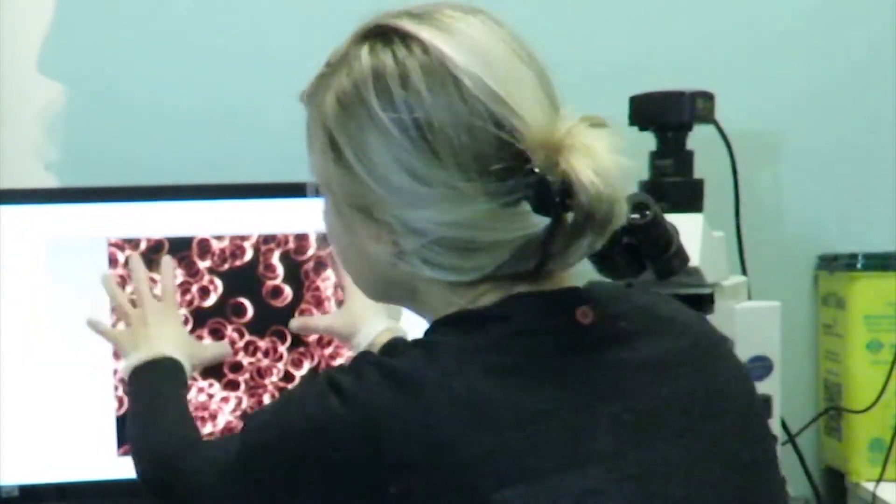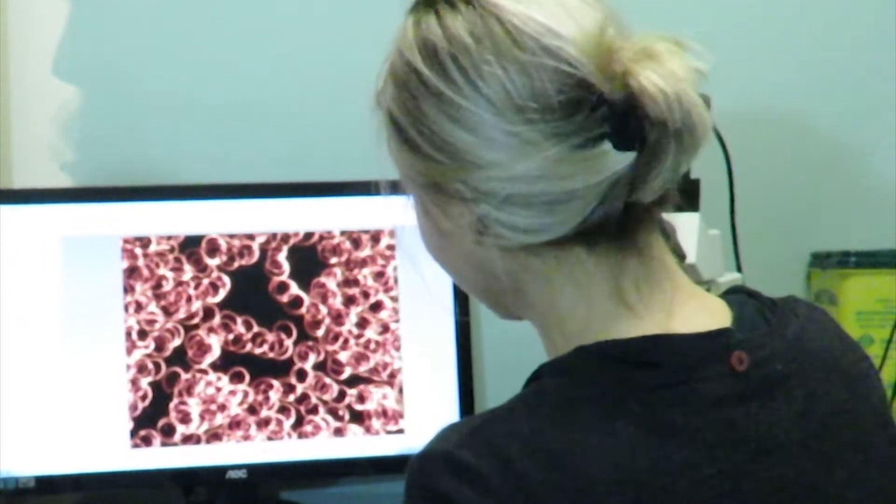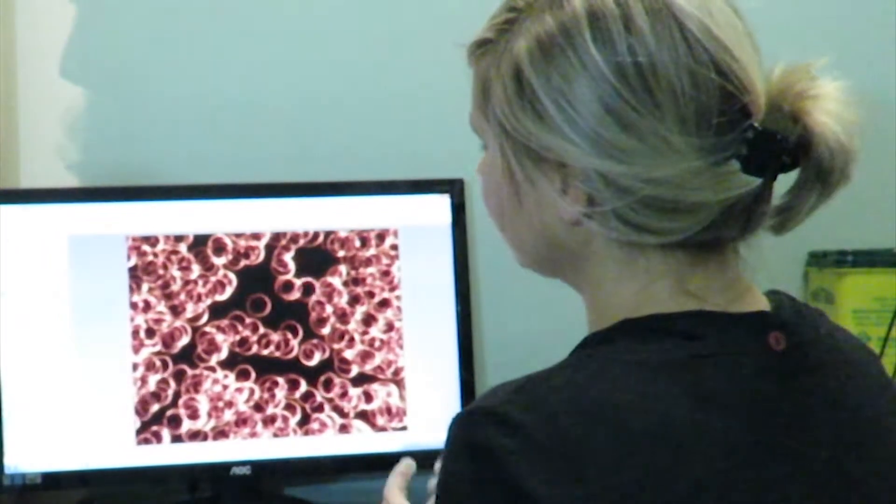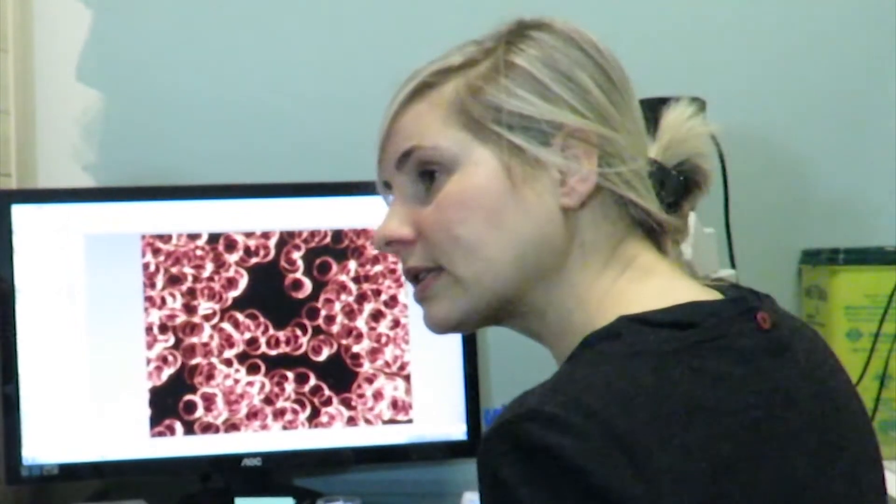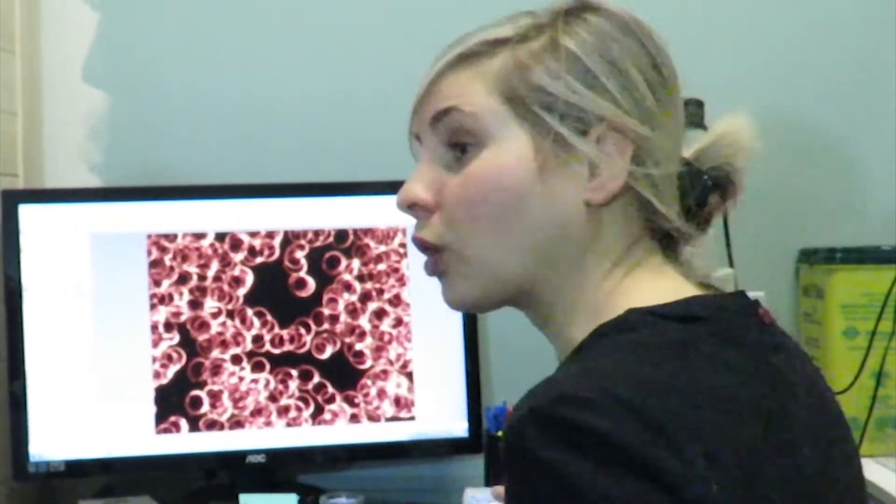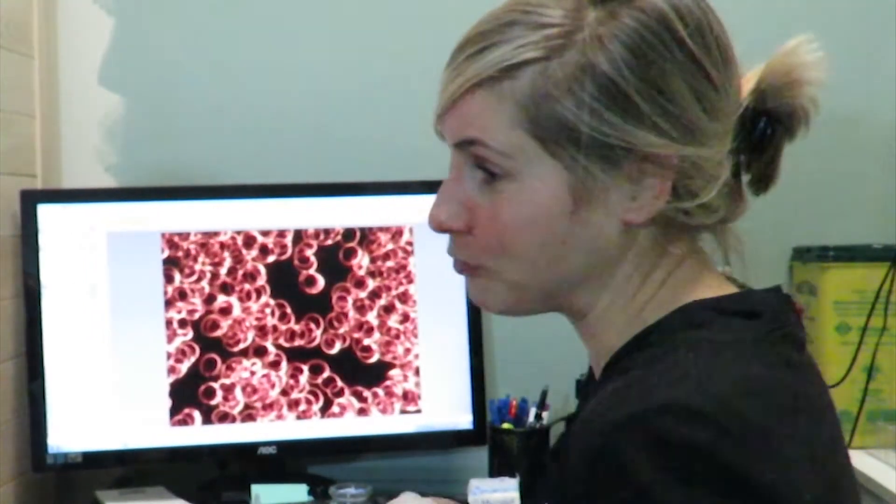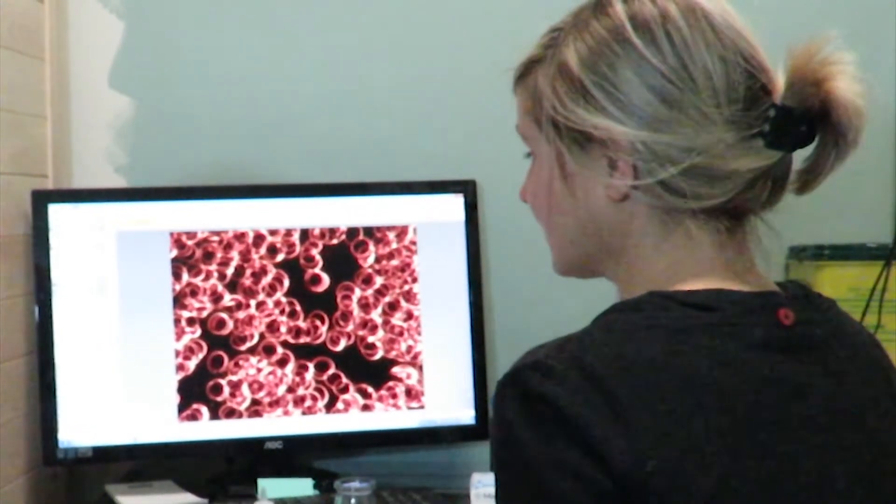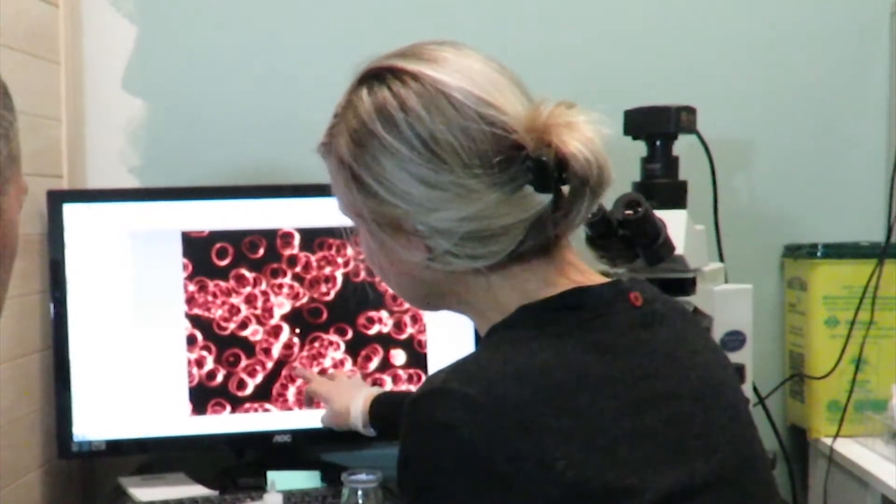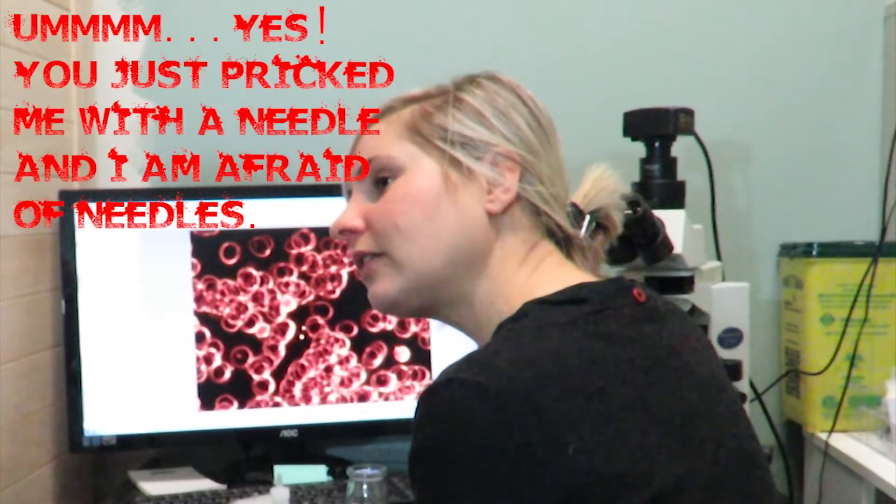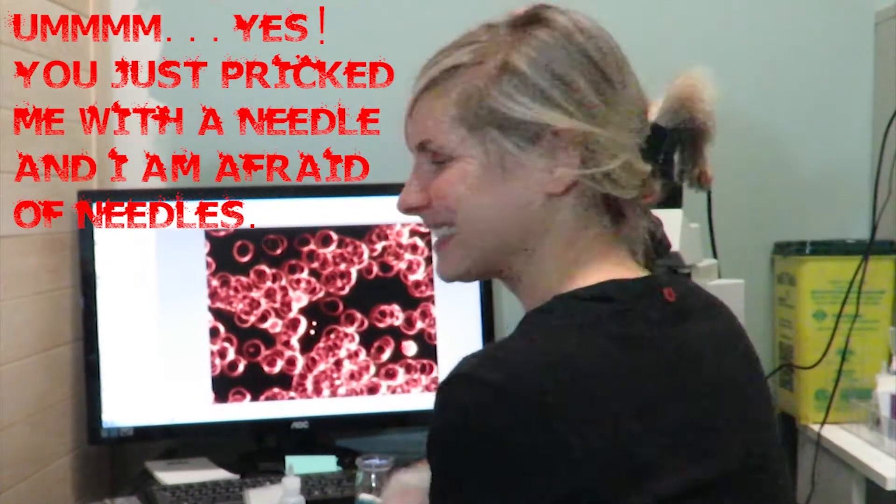It's normal to have parasites in our body. We don't live in a bubble as human beings. We just don't want to have an abundance of them because they'll make you feel tired, they'll make you feel run down, they'll cause skin issues and stomach and digestive issues. But overall, Greg, look at this. Yes, it's a little clumpy and the cells are layering on top of each other a little bit. It's not because they're dying, it's just because the plasma has now slowed down. Maybe there's a few little toxins here and there, and that's normal because we're human.